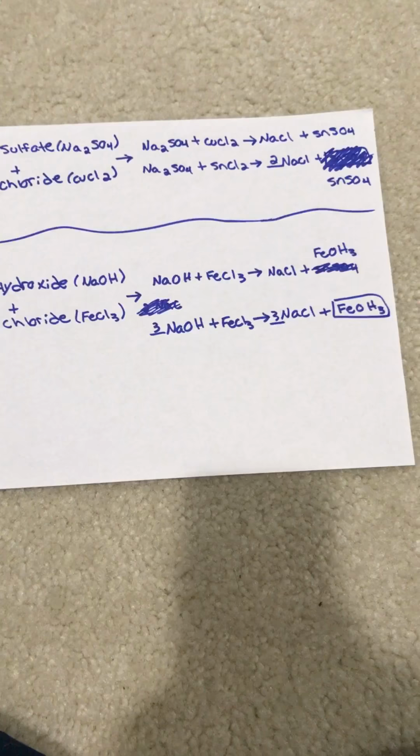Alright, so for the Reactions and Solutions Lab, our task was to gather 10 chemicals, which were sodium iodide, sodium carbonate, sodium phosphate, sodium sulfate, sodium hydroxide, and cobalt chloride, copper chloride, strontium chloride, tin chloride, and iron chloride. So we grabbed the first 5 and combined them with the second 5. Basically, for every group A chemical, we combined it with a group B chemical in a well plate to see if they form precipitates or not.